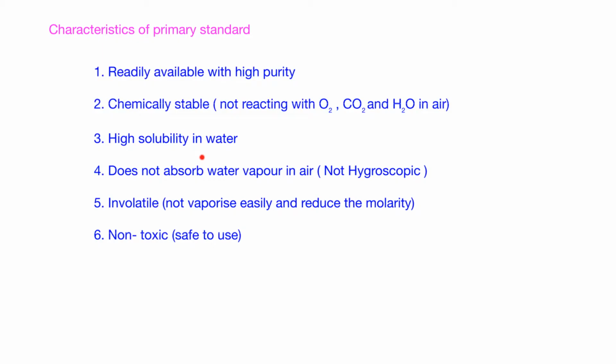And because we are going to dissolve the chemicals in water, it has to be highly soluble in water, but at the same time, it should not absorb water vapor in the air. That means it is not hygroscopic. These words, you have to pay attention to that.